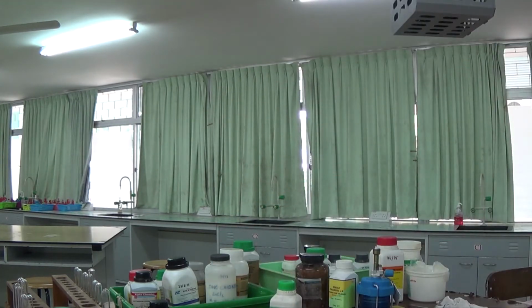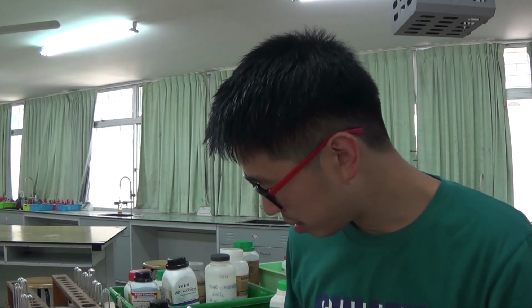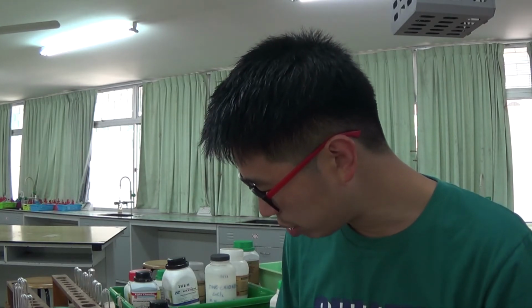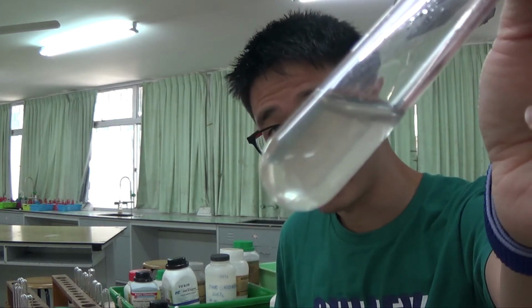Let me go and grab a white background. A bit colored, but not really that intensely colored. This is iron 2+ in solution. So remember, this is iron 2+ aqueous. It is not a solid. Aqueous means it's a solution, and this is without hydroxide in it.